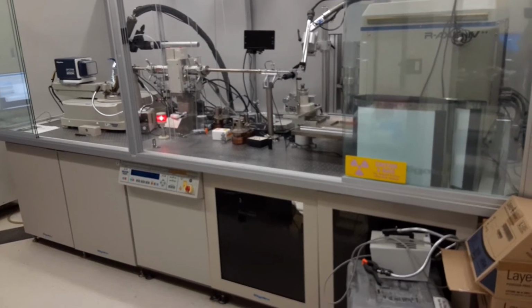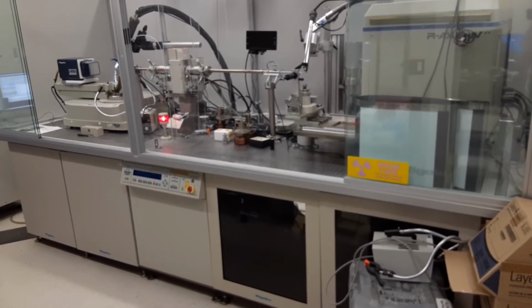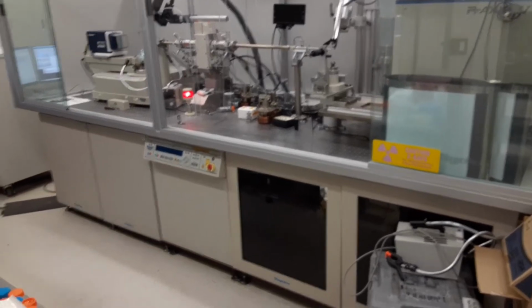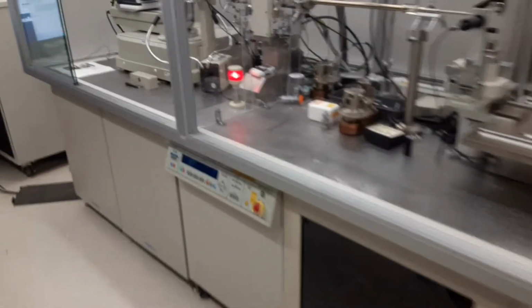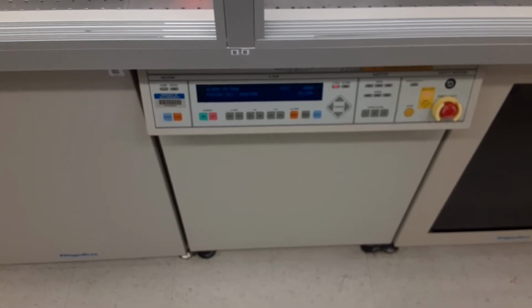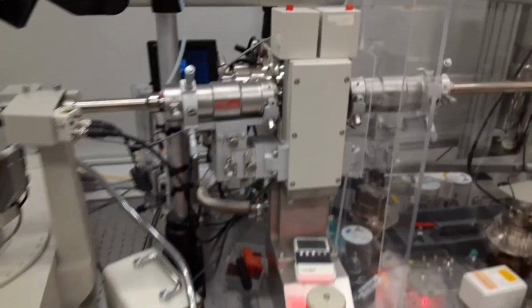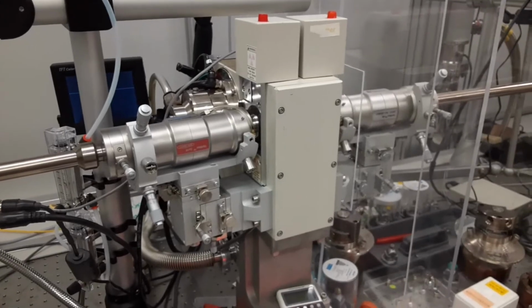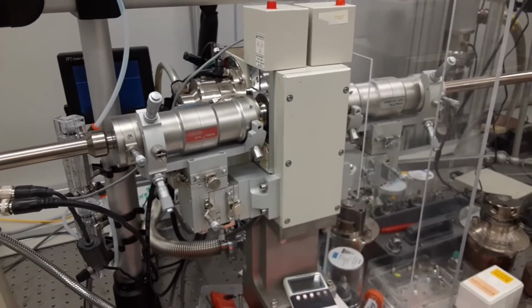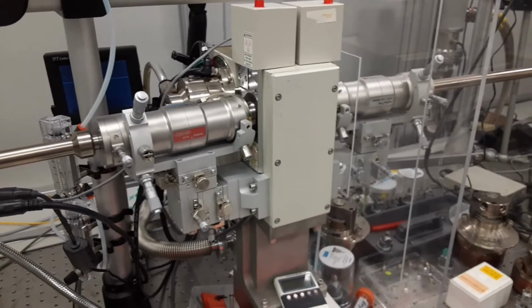This is our Rigaku X-ray generator and detector system. So I'll give a brief overview of the major components. The generator itself is located in the center. Below is the control panel, full of the electronics. And up here in the center of the table is what's known as the tube tower. Inside the tube tower is where the X-rays are generated. We'll get back to that in greater detail in a minute.